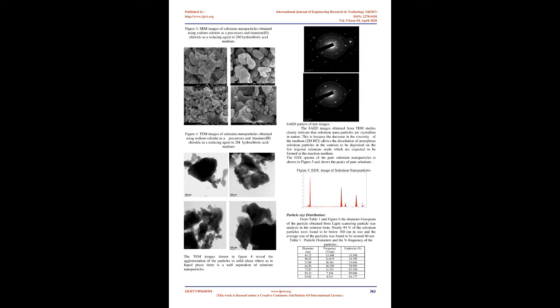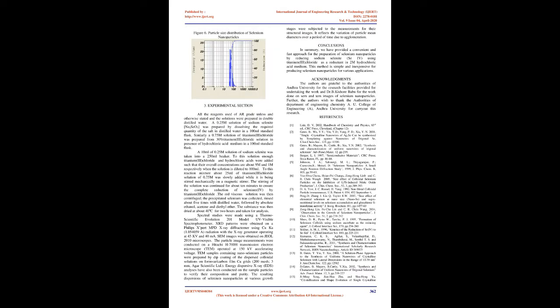XRD pattern for selenium nanoparticles. From the UV-Vis spectra shown in Figure 2, it is observed that the λmax of the selenium nanoparticles was at 311 nanometers at lower concentrations, whereas in higher concentrations no specific λmax could be identified; rather, a steady increase in absorbance from 800 to 300 nm was observed. The UV-visible spectra are comparable to those of selenium nanoparticles prepared by reducing with hydrazine hydrate 36. Form of the produced nanoparticles: SEM, TEM, and EDX studies.